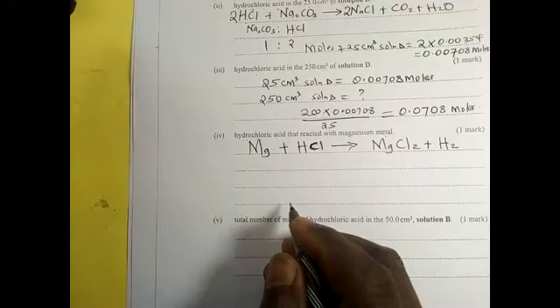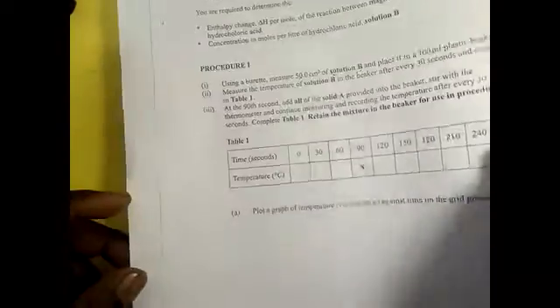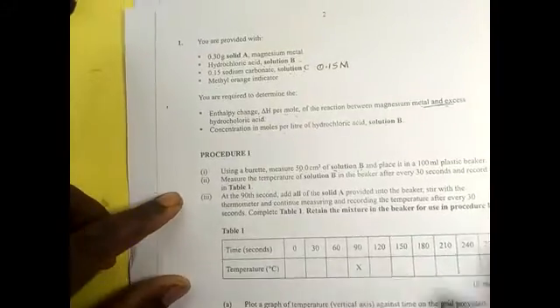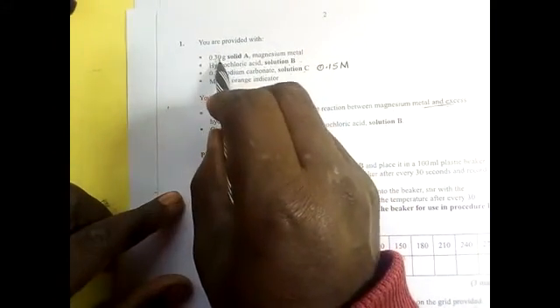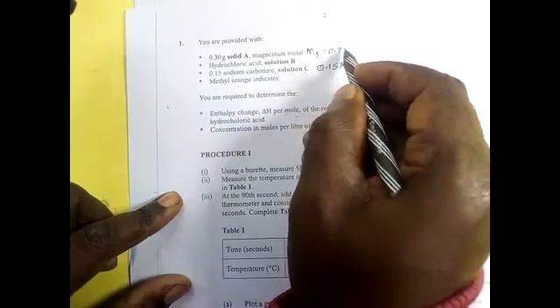But remember, we were given 0.3 grams of solid A. So magnesium requires 0.3 grams.